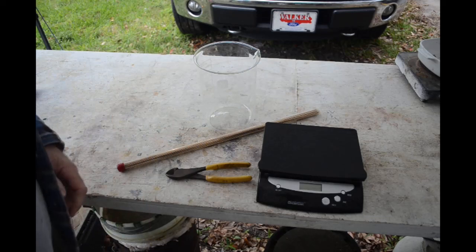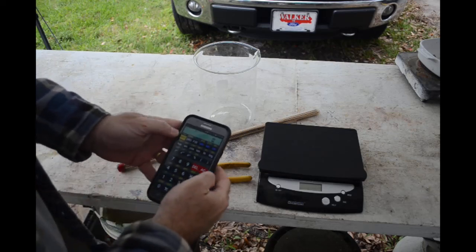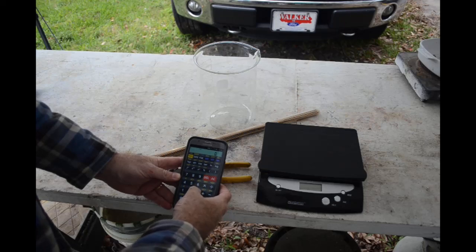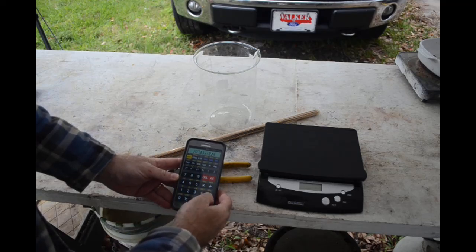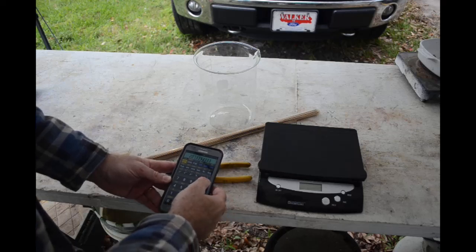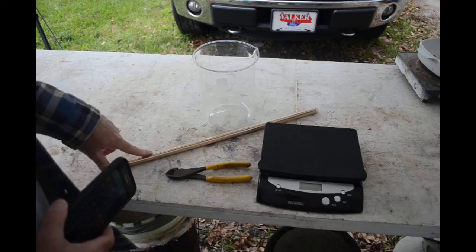There's a little over 31 grams in a troy ounce — 31.1 I think it is, divided by 0.15 for 15%. So I need a little over 200 grams of brazing rod — 207 grams — to get a troy ounce. I may go a little higher just to allow for any losses in the process.